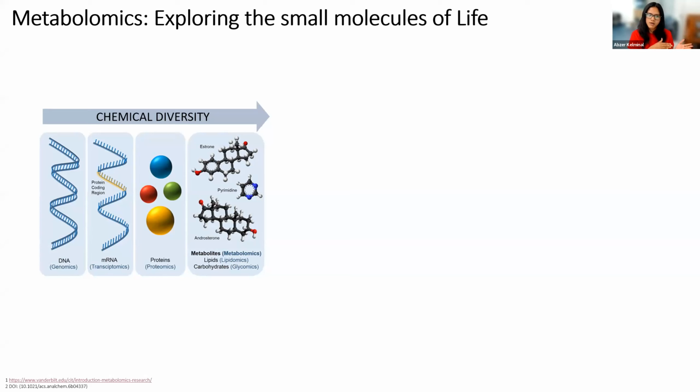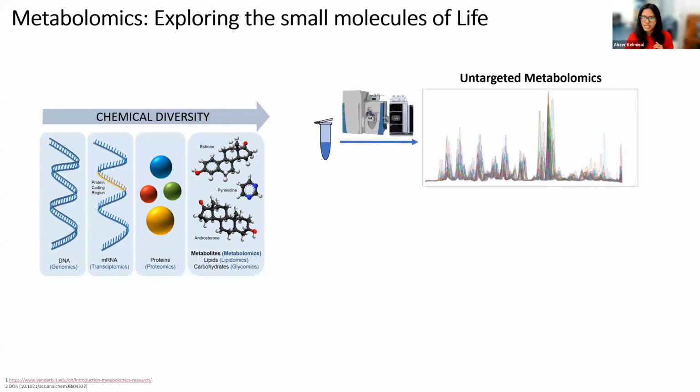Unlike other omics, such as genomics, transcriptomics, or proteomics, which are advanced and already have really nice workflows, with metabolomics we do not have that much consensus on the workflows.